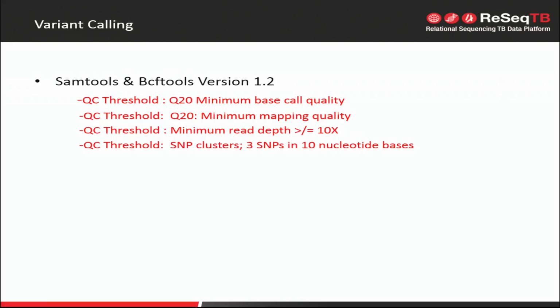It was a cutoff. And if anything that's below that, we definitely don't want to use. And there we do have windows that we look at to make sure, because we look at the coverage report. Coverage is very important, especially around drug resistance, when we want to start looking at heteroresistance. There's been quite a bit of discussion. What is the magic number of coverage that we need?